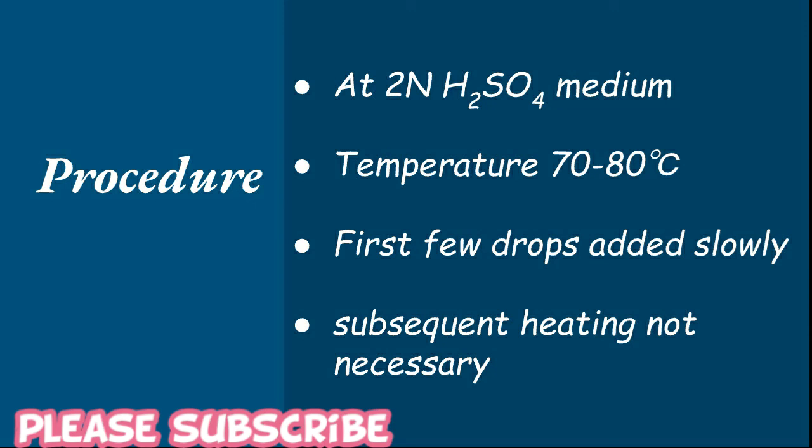Now when we add KMnO4 from the burette, the first few drops are added very slowly. There is a reason which we'll discuss later, and there is no requirement of subsequent heating.